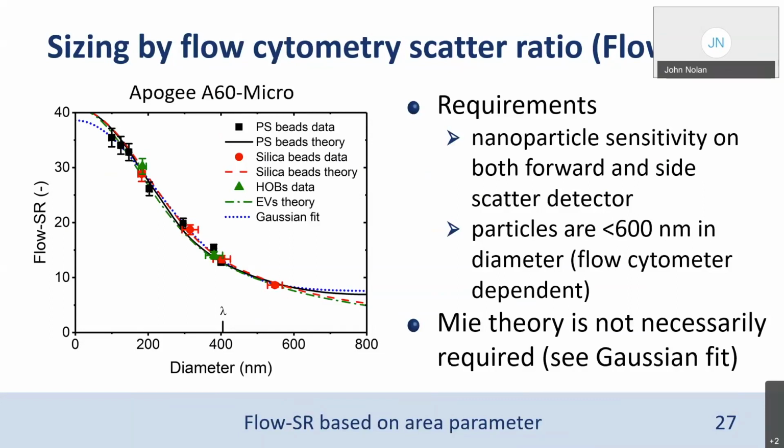All right. Esteban asks, does the refractive index change if we change the permeability? Presumably he's talking about permeabilizing somehow a vesicle. Yeah. Presumably, yes. We didn't measure it, but I would say that.